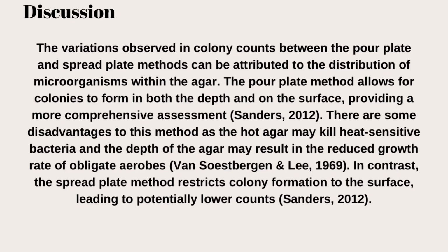The variations observed in colony counts between the pour plate and spread plate methods can be attributed to the distribution of microorganisms within the agar. The pour plate method allows colonies to form in both the depth and on the surface, providing a more comprehensive assessment. There are some disadvantages to this method, as the hot agar may kill heat-sensitive bacteria, and the depth of the agar may result in a reduced growth rate of obligate aerobes.